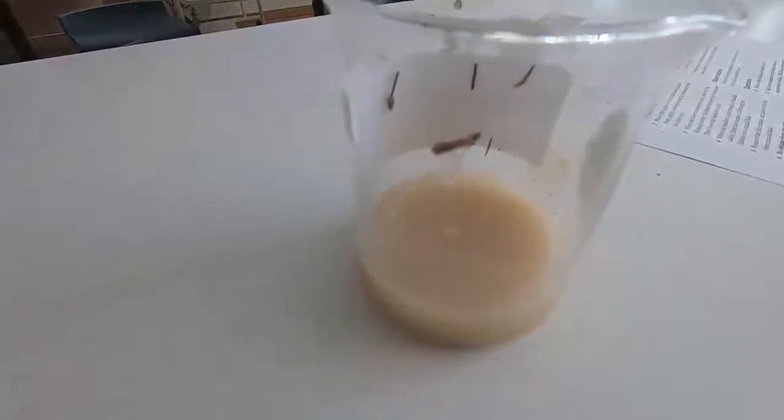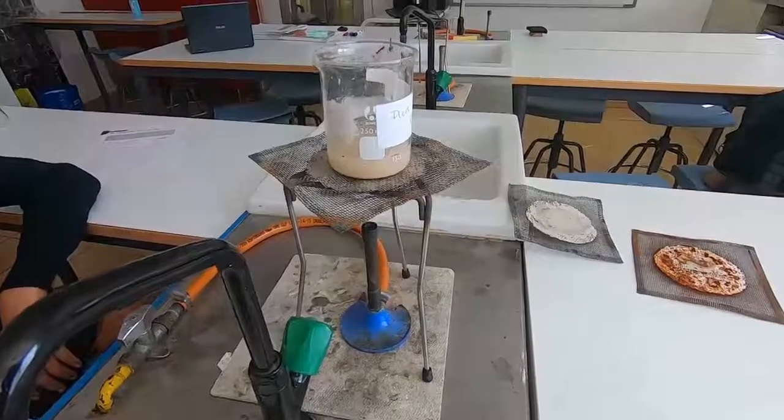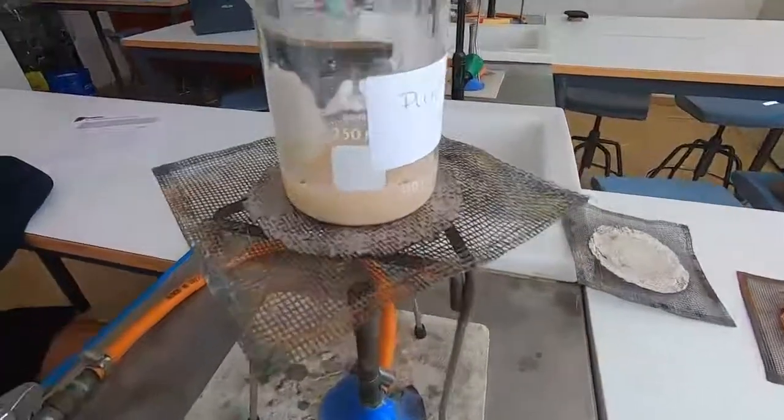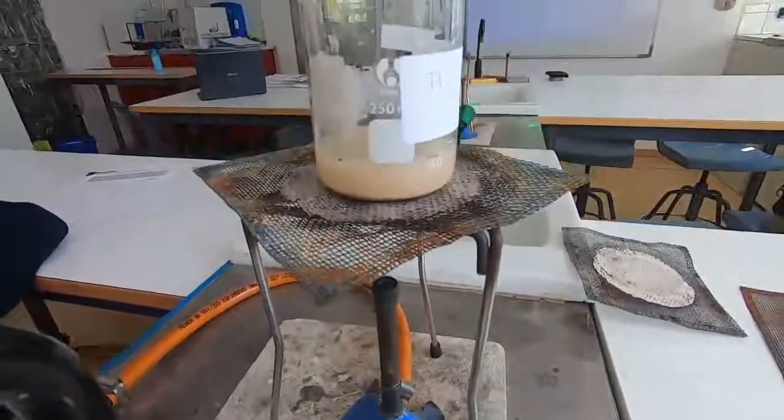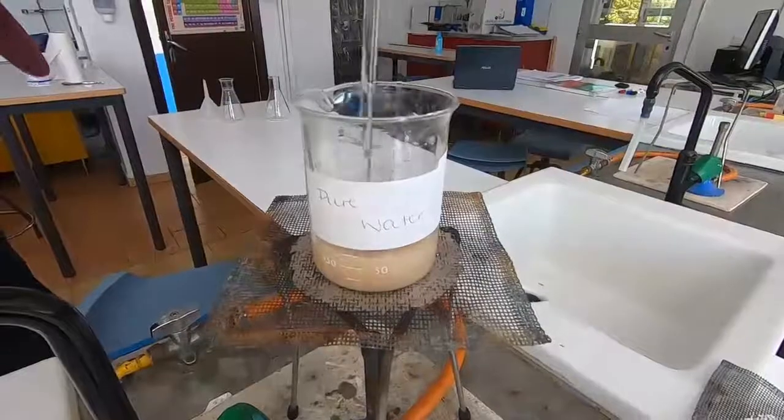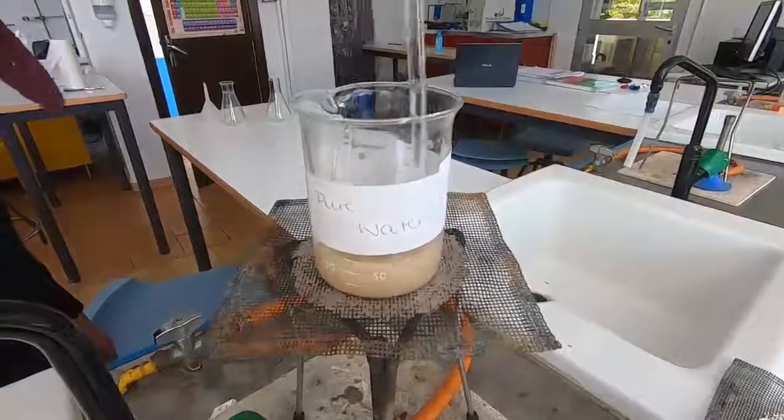There are one or two pine needles in our sample and to make sure that it all dissolves we're going to warm it up — that will help the dissolving and make it a little bit quicker. So we just put it on the tripod and gauze, warm it up with the Bunsen burner and we stir.